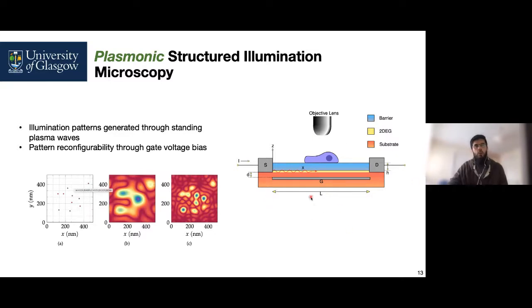When this proposed technique is simulated, let's say we have a sample in which molecules are spaced in this spatial distribution. The image that we would get from a conventional microscopic technique would be this blurred image, and we see that we are not able to resolve closely spaced molecules.